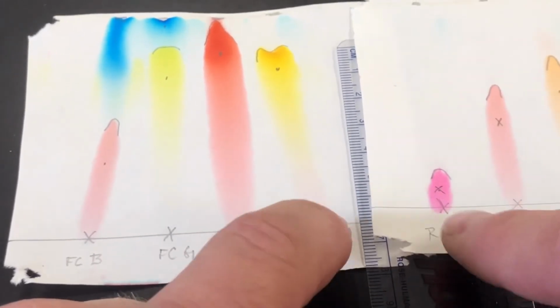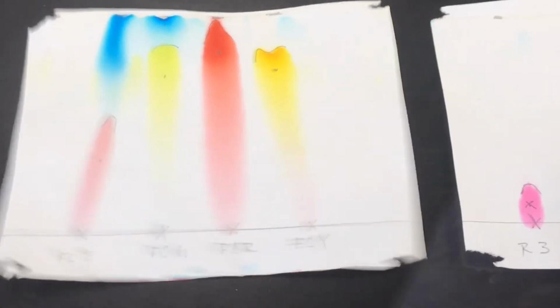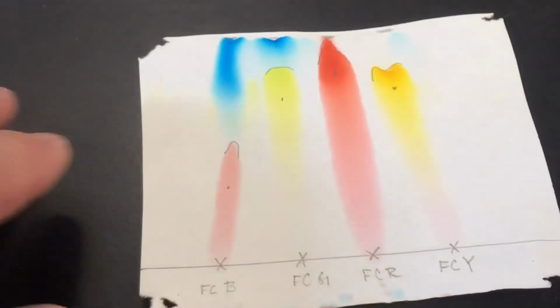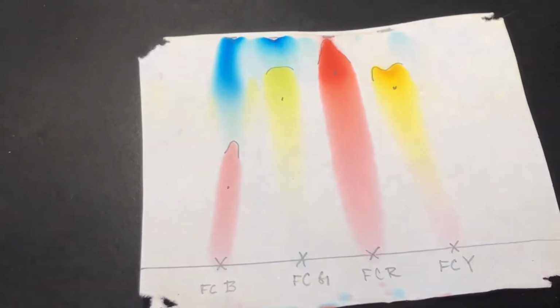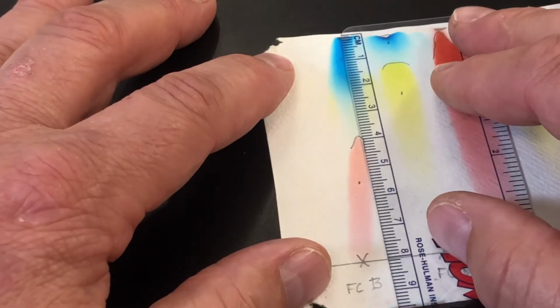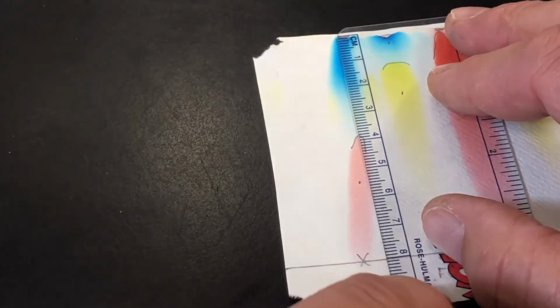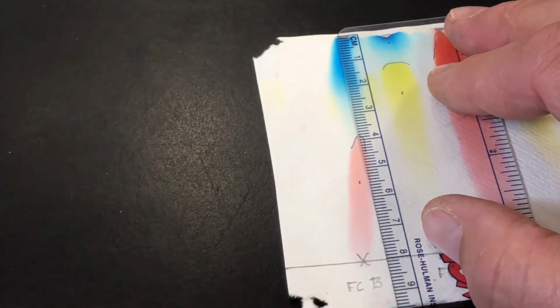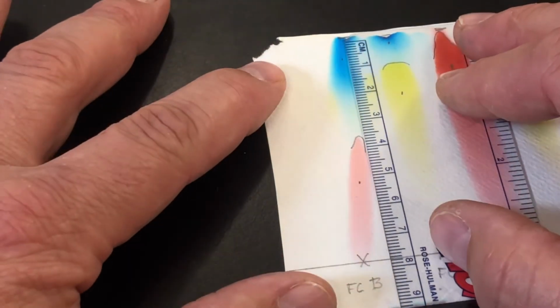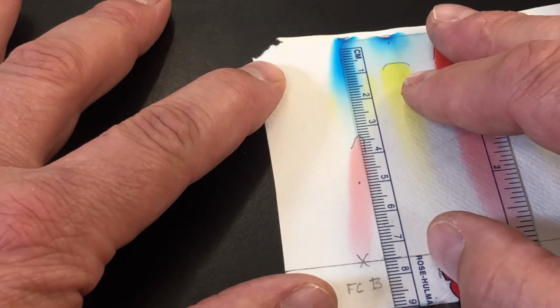If I'm looking at that, I'm thinking that's a little bit of red number 3. So just eyeballing these things kind of helps us to understand what we're probably going to get as a result from our math. And so if we're looking at how far it went, this one traveled, let's say 8.00 centimeters. The blue itself probably traveled about 7.50.